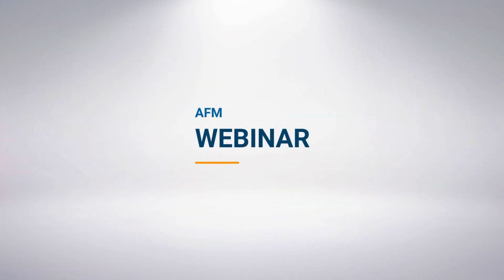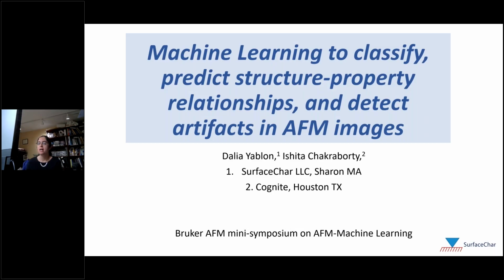So there are two different parts to my talk. The first will be using machine learning to classify and predict structure property relationships from AFM images. And the second will be a recent project that we did on artifact detection in PF-QNM. This is work that I've done with Ishita Chakraborty, my partner in crime on all of this, and she's down at Cognite in Houston.